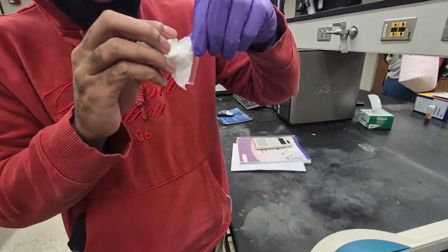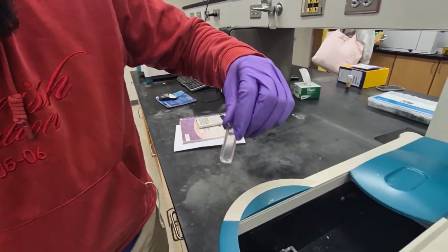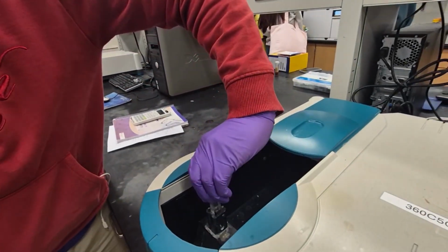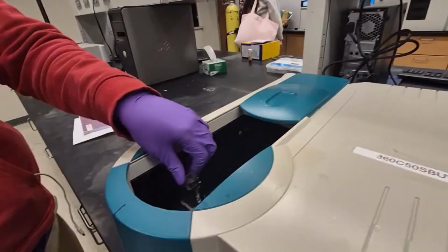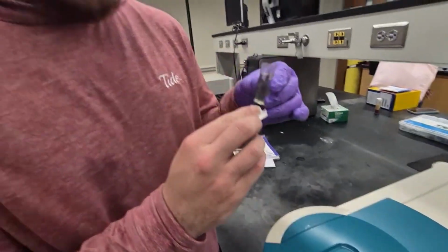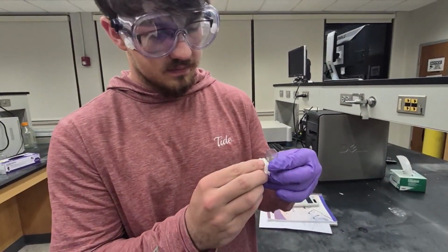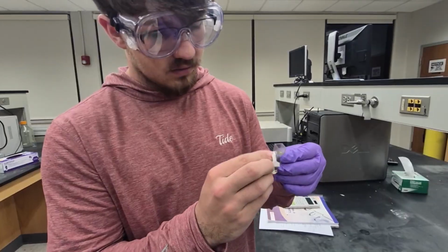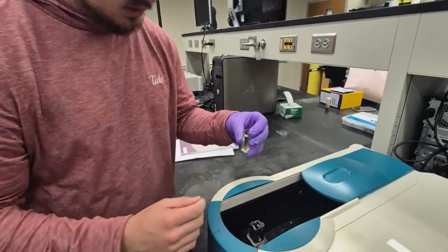Absorbance is determined via the spectrophotometer, where we put the cuvette that has the solution in, and we put in a specific wavelength, and that specific wavelength is typically the maximum absorbance the solution will make. We put the cuvette into the spectrophotometer and it will output a specific absorbance. Path length is determined via how much distance the light goes, and it is usually fixed at 1 centimeter in most laboratory settings. And in our situation, it would be the length of the cuvette.